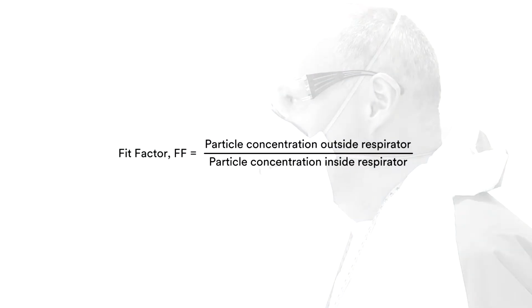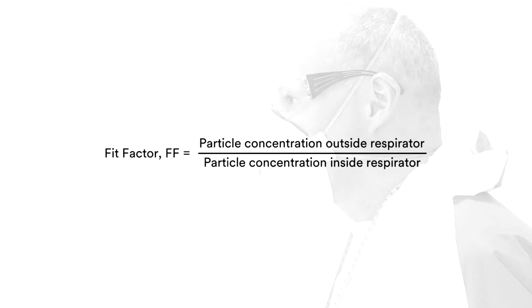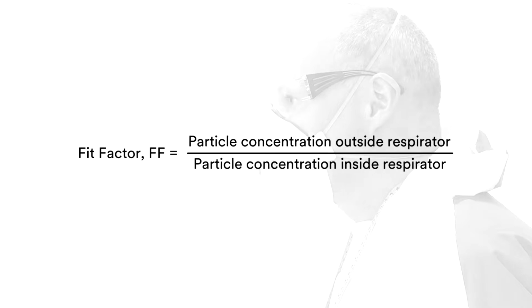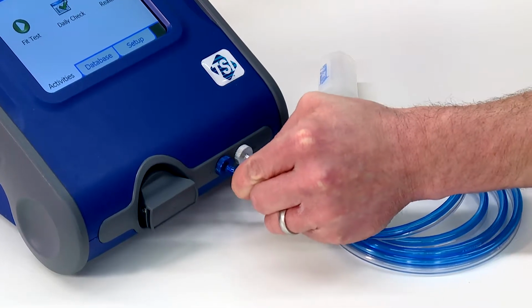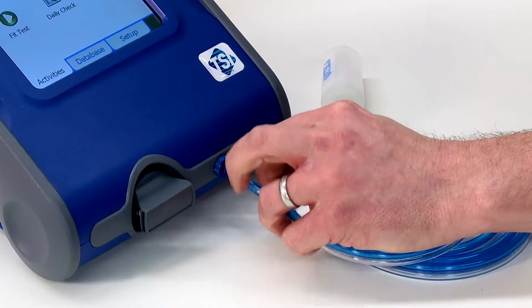The PortaCount measures the goodness of fit of a respirator by counting the number of particles both inside the mask and outside in the ambient air. From this, a fit factor is calculated. Two tubes connect to the PortaCount. The blue tube is open to the ambient air. The clear tube needs to be connected to the mask being fit tested.